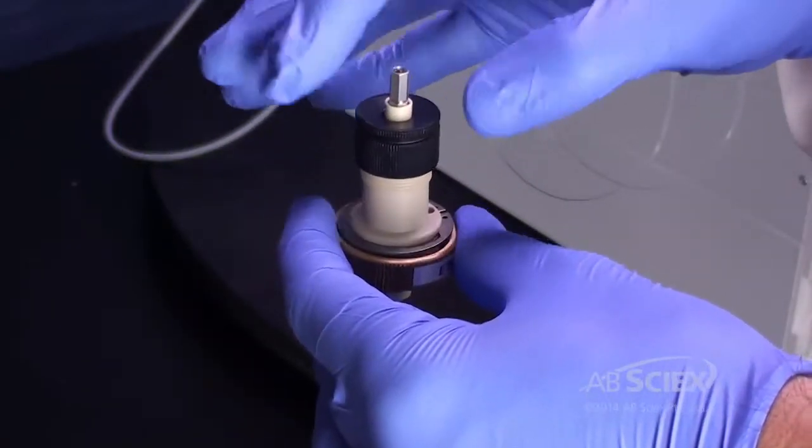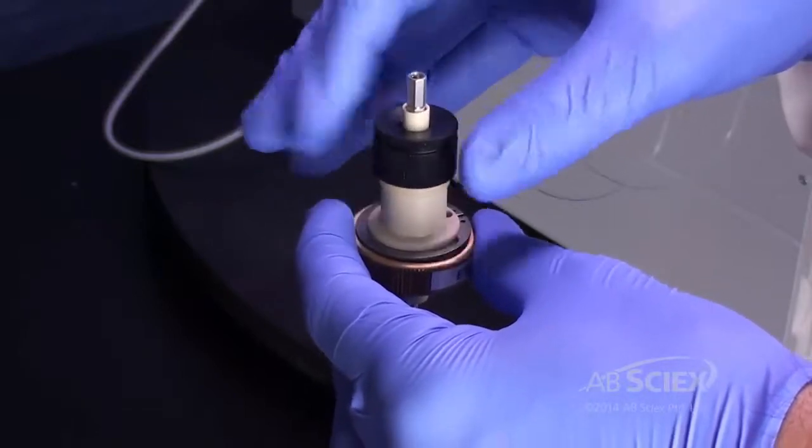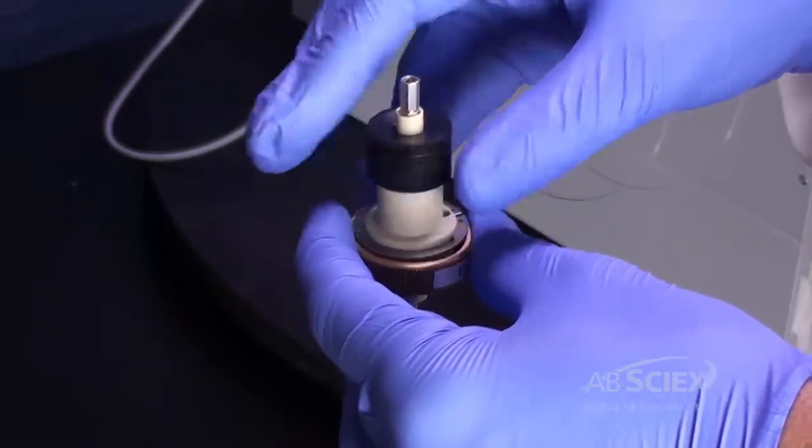Screw the cap only a few turns so as not to expose the electrode to prevent damaging the electrode tip whilst reinstalling the probe.